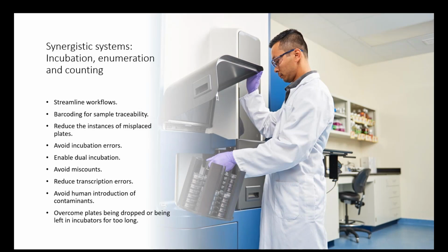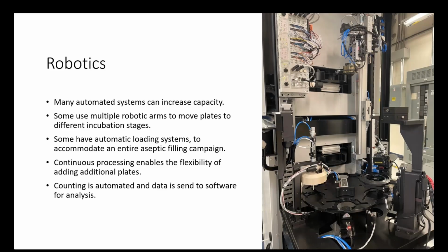And we can also avoid miscounts, reduce transcription errors, avoid the human introduction of contaminants, and also preserve the integrity of plates by less chance of dropping them or leaving them in incubators for too long. One way to promote these better synergies is through the use of robotics.